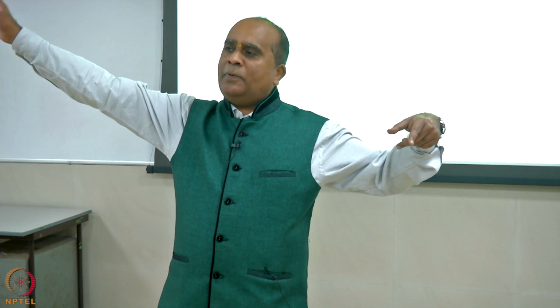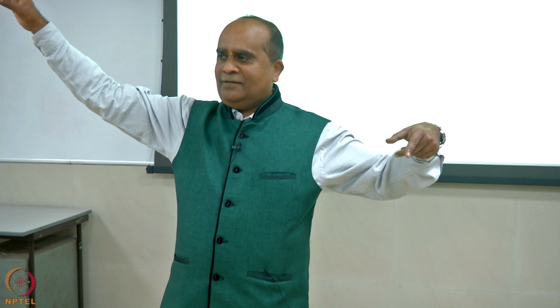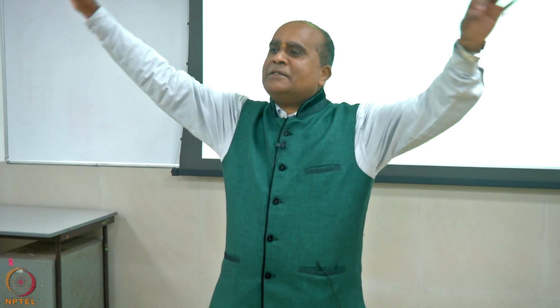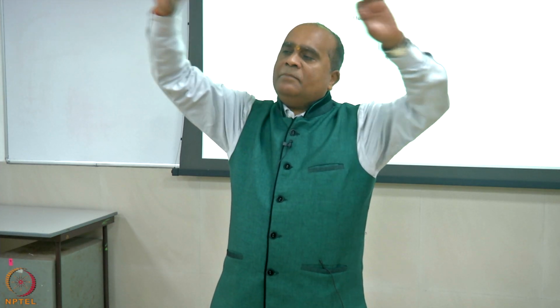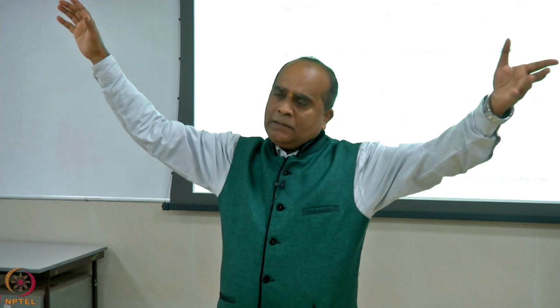A poor tryptophan is sitting alone here, right, there is no one to talk to. I want to see how these two are talking to each other, then what do we have to do? I have to attach something here which can talk to this one when they come together. So, something like this. So, you require an extrinsic fluorophore, right? Extrinsic fluorophore, let them talk sometimes.